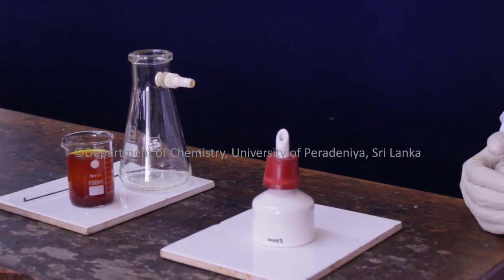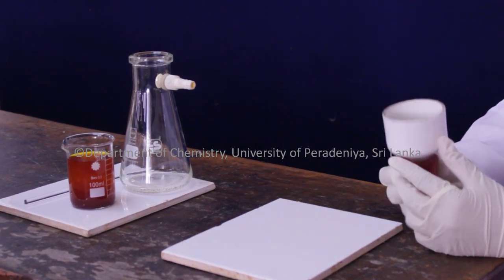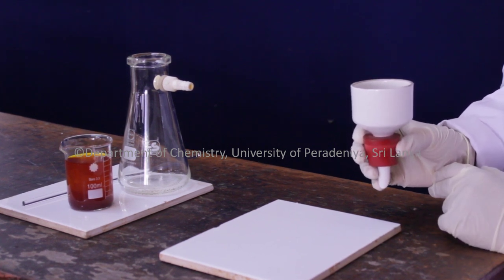In this video, we will be discussing the Buchner funnel. The Buchner funnel is a laboratory equipment used to filter, which uses suction to speed up the filtration process.